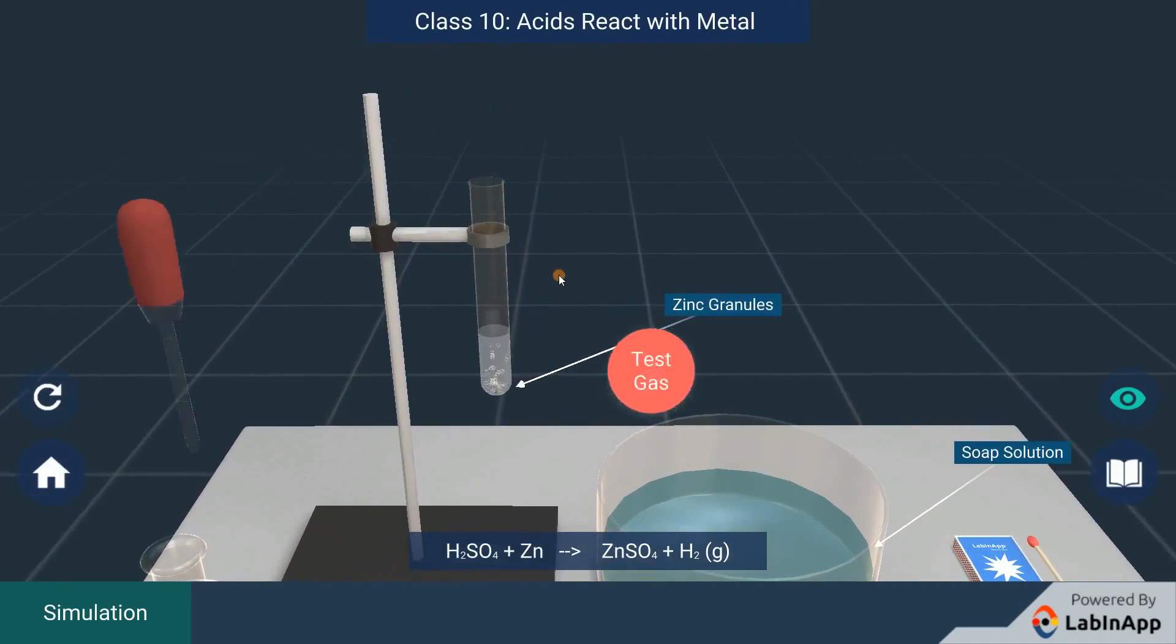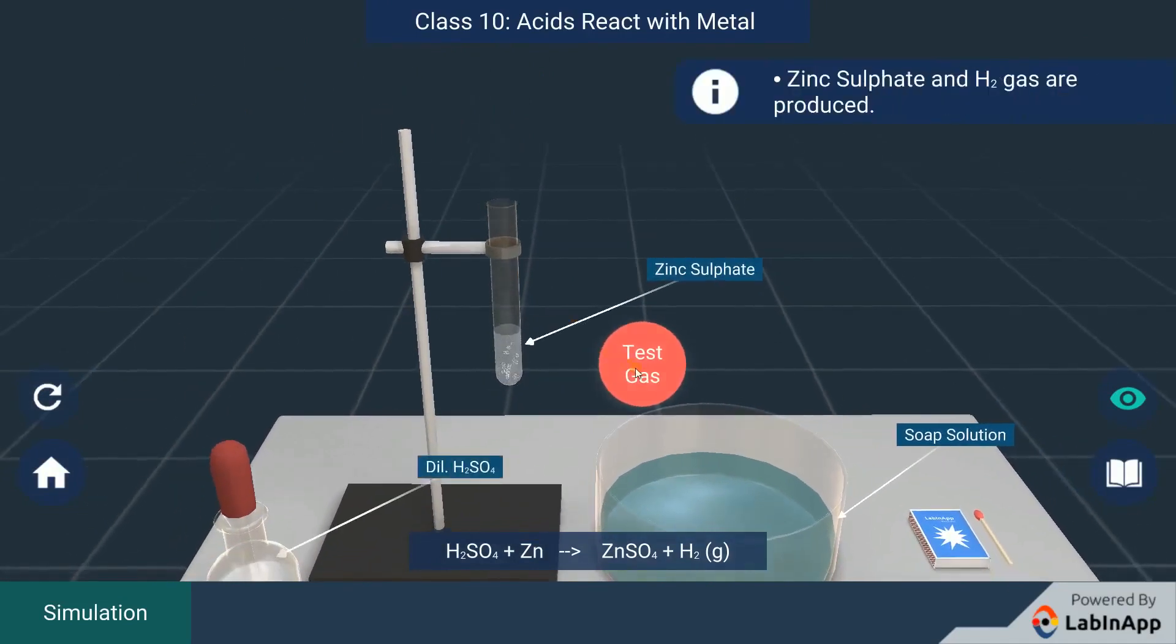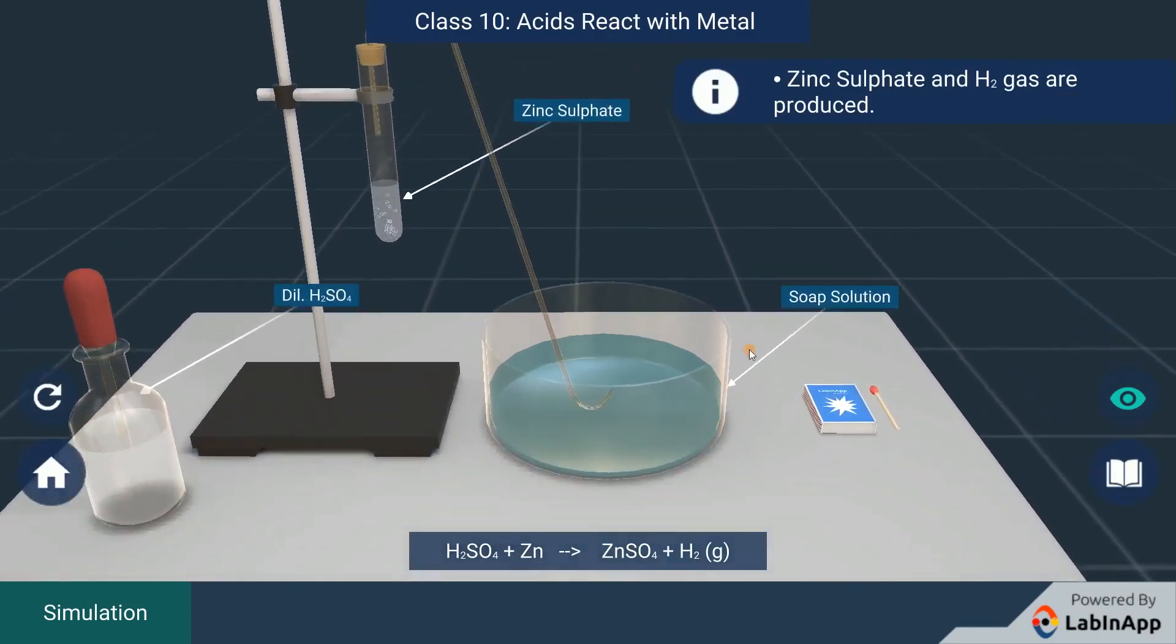The sulfuric acid reacts with zinc and releases hydrogen gas. To test this gas, we pass it through soap solution using a pipe and cork setup.